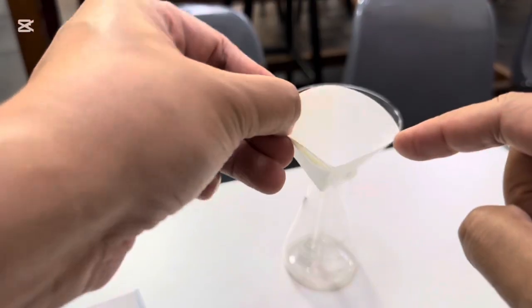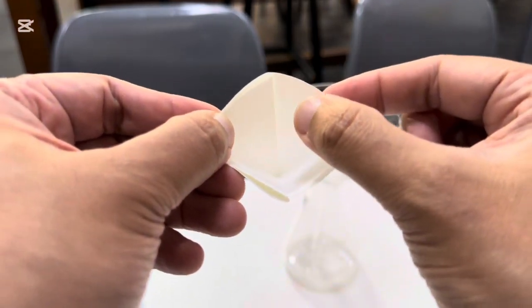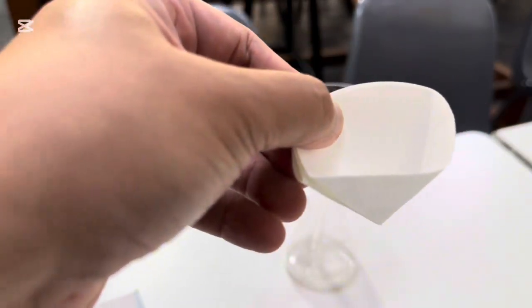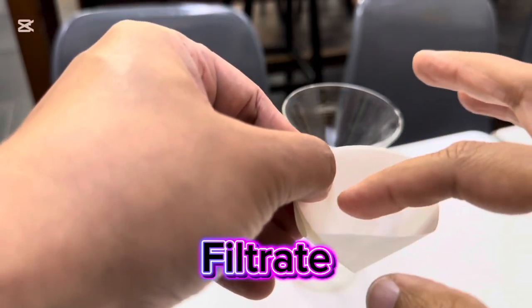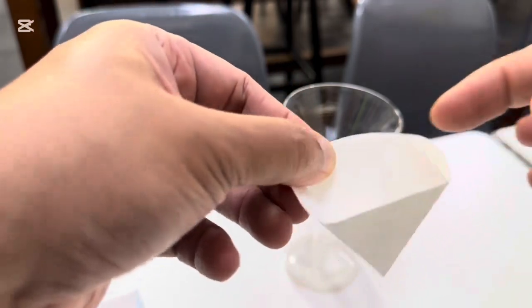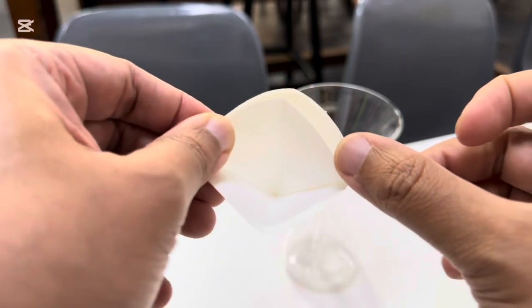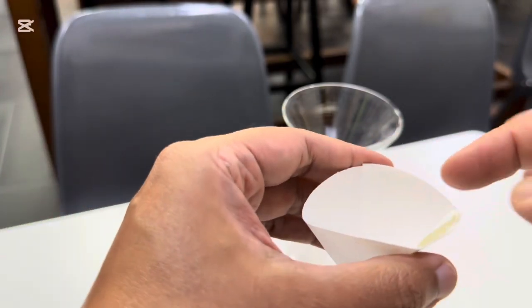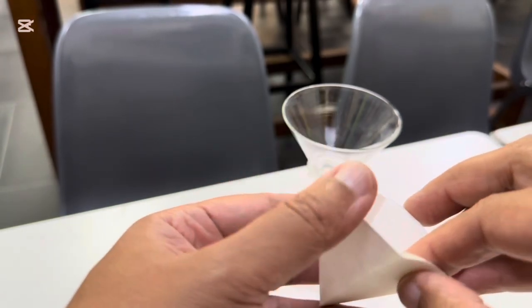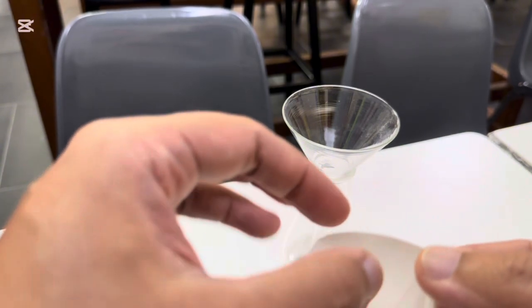The reason is that you have this part over here, which is just one sheet of paper thick. The solution that you're trying to pass through, the filtrate, will have insoluble parts to it, which will form the residue. If you try to filter through this part over here, you have not just one, not just two, but three thicknesses of paper. So the filtration occurs much faster in a shorter period of time along this half than this.